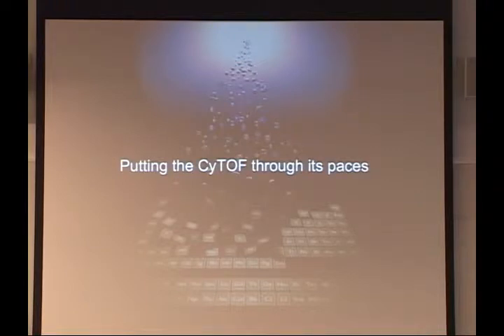So now that we've got kind of the basics of how it works, I'm going to show you guys a little bit of QC data for when we were putting the CyTOF through its paces initially when we first started doing some of this work.